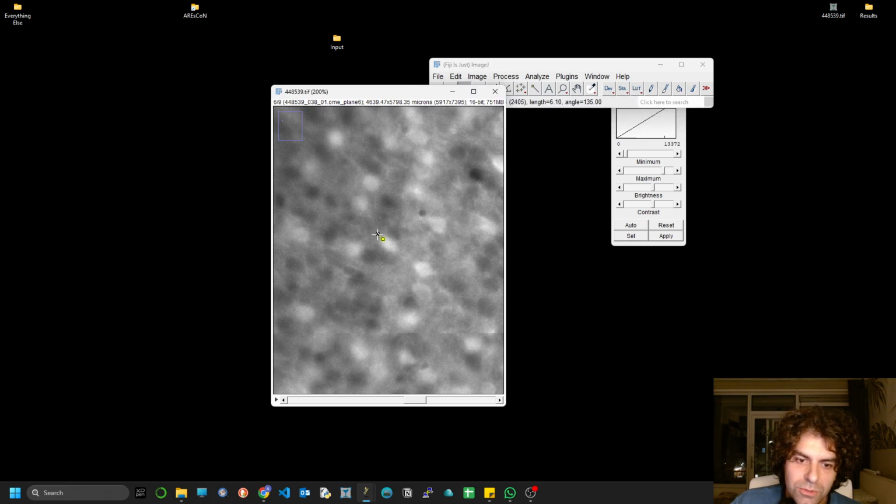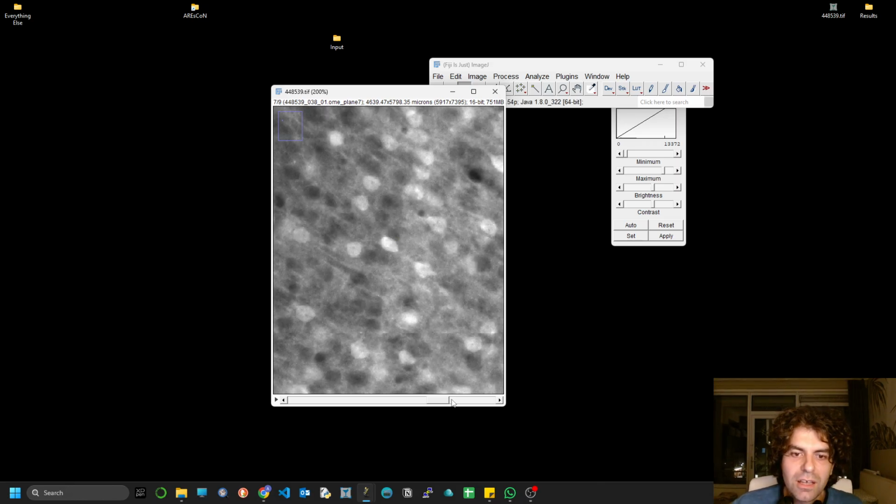So if there was an observation, let's say here, there is an algorithm that AResCoN uses to filter out the excess observations that come from overlapping regions that correspond to the same neuron, to the same observation. Here I should also say that you can use AResCoN both for detecting the whole cell, the cytoplasm that is, or you can just go for the nuclei with CFOS.